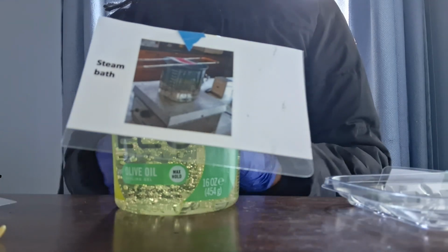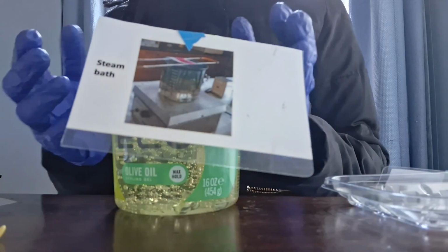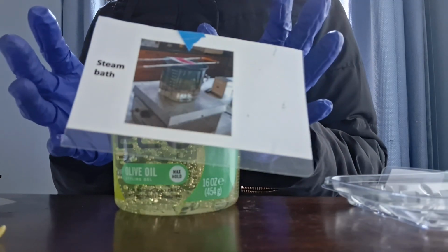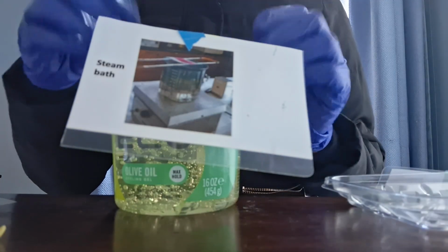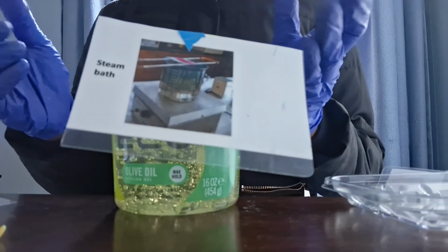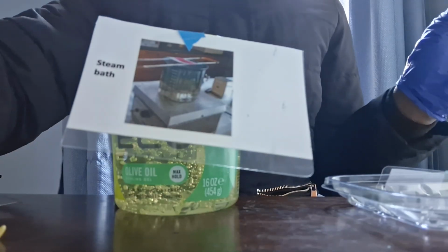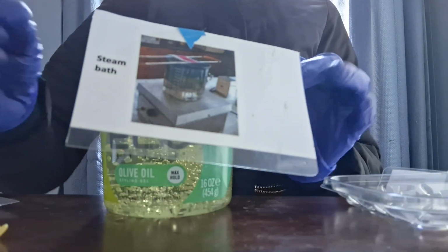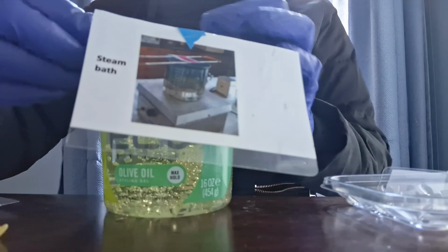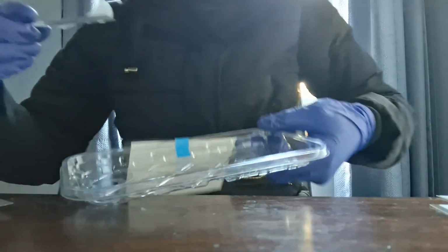It ensures acid-fast bacteria retain the red stain. Once the dye is inside, the waxy wall will trap it, so it will even stay red after the acid alcohol. After it has remained on this, we remove it from the steam bath and place it back into the staining tray, as you can see here.